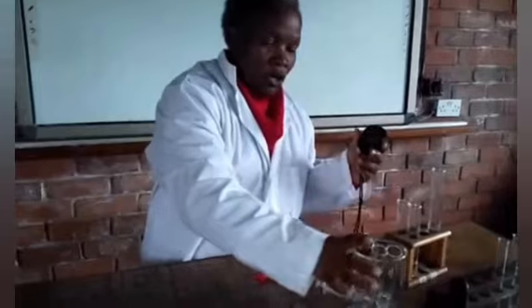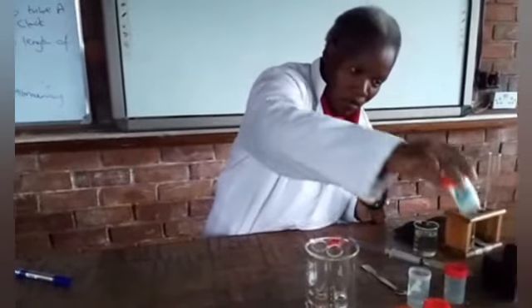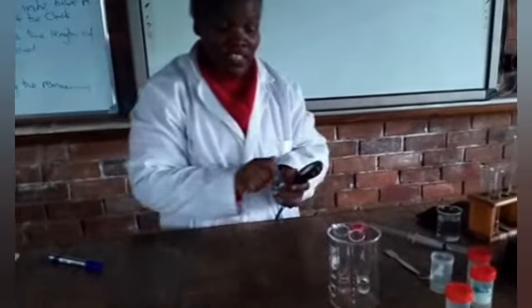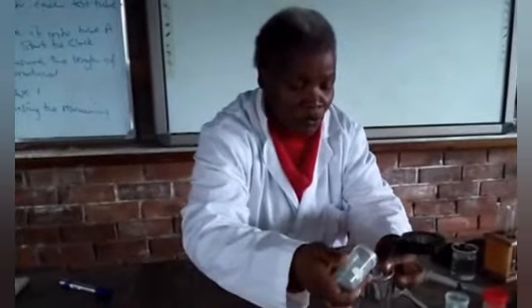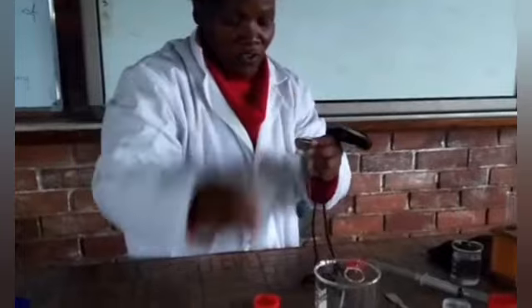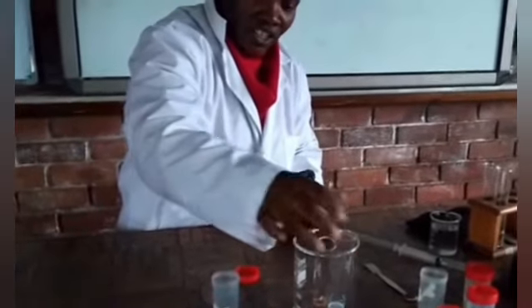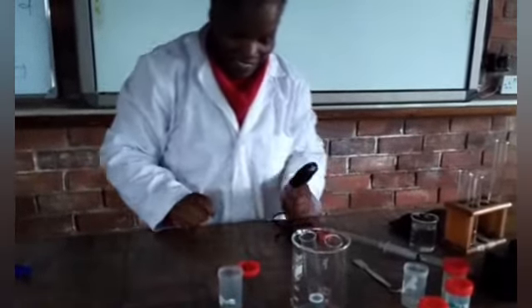Okay. So the next element, according to my table, is zinc. Unfortunately, I was not able to find granules. I obtained the powder. So if the results are too different, this might also be a possible reason. Okay, well, after 1 minute, I'm adding this one so that I give myself time to record. So this is my zinc, and again I swirl a bit to encourage the reaction. And I will swirl this again. Okay, that is my zinc.